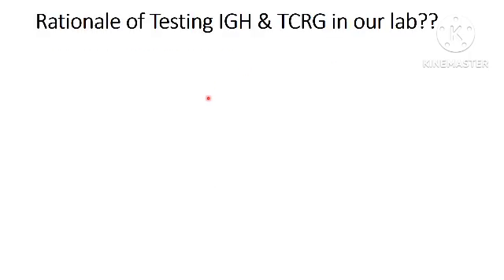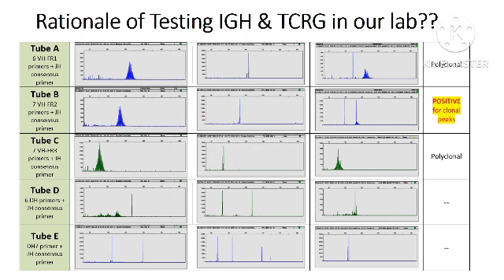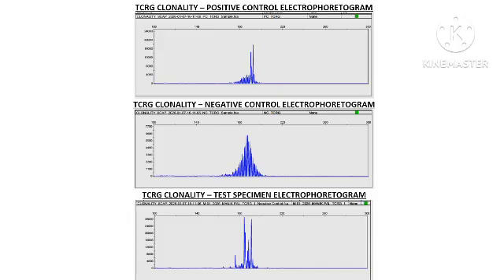The difference between IgH and TCR-gamma assay, and why we are using IGH and TCR-gamma as the most common test for clonality. Let's find the answers in subsequent slides.